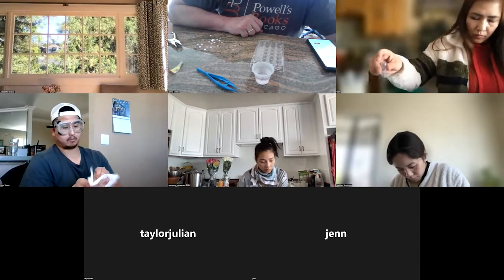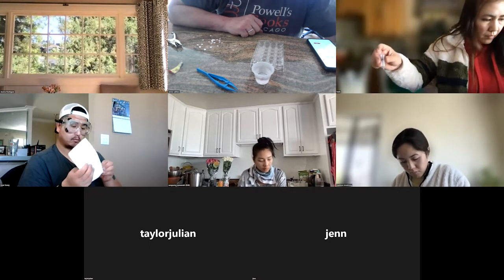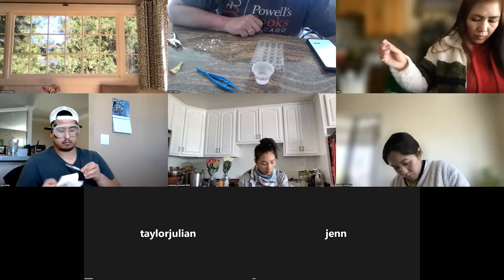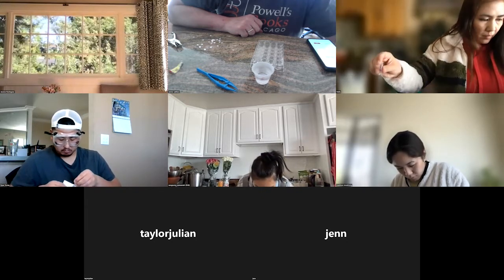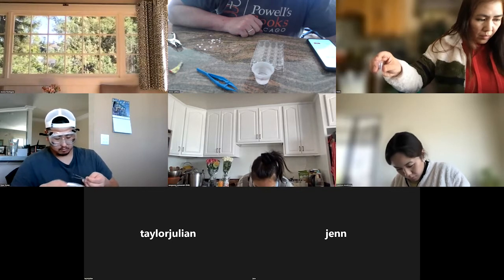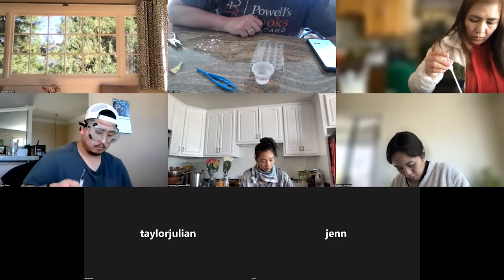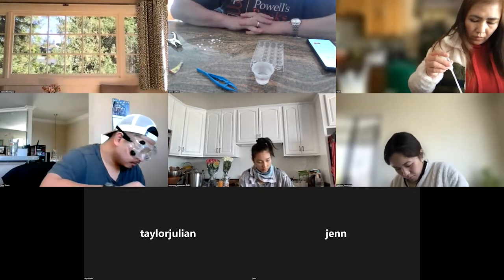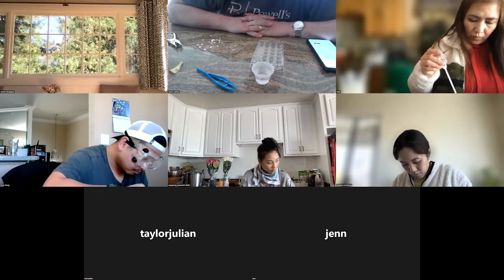Well, if the point is that an uncatalyzed reaction really doesn't happen at all, they're making their point quite well, I would say. I mean, not only is it not floating to the top, it's not moving at all. I don't see any bubbles being made.